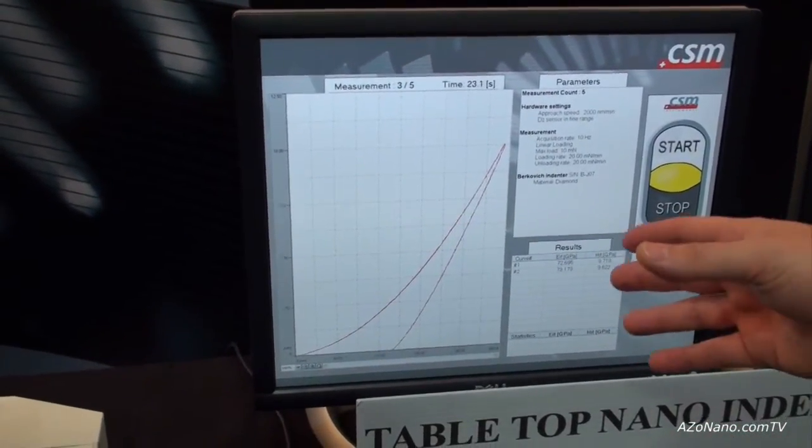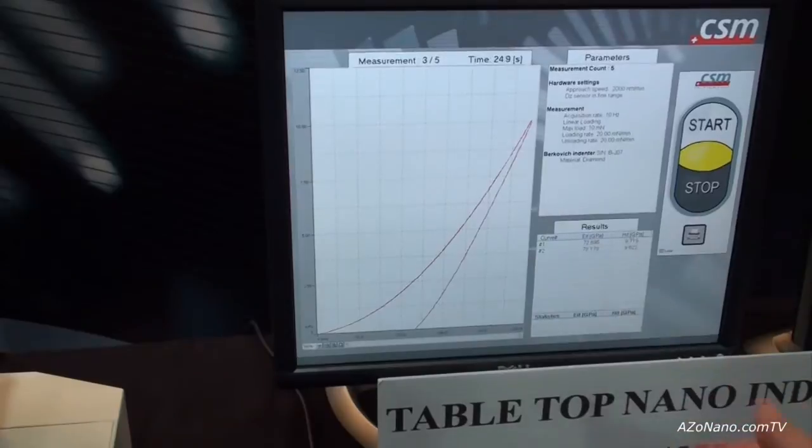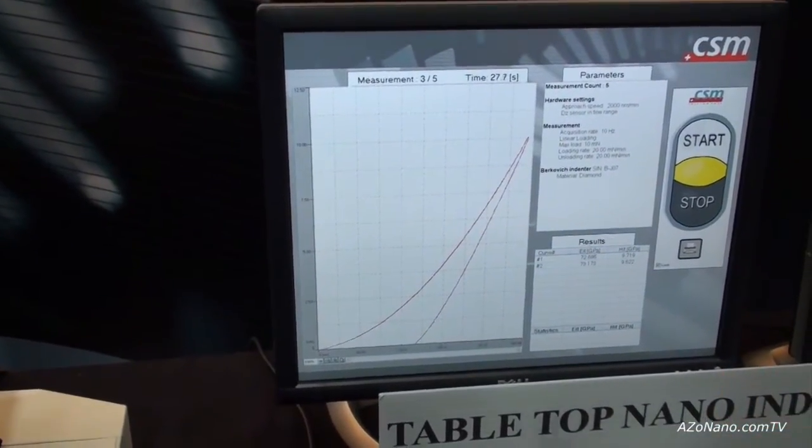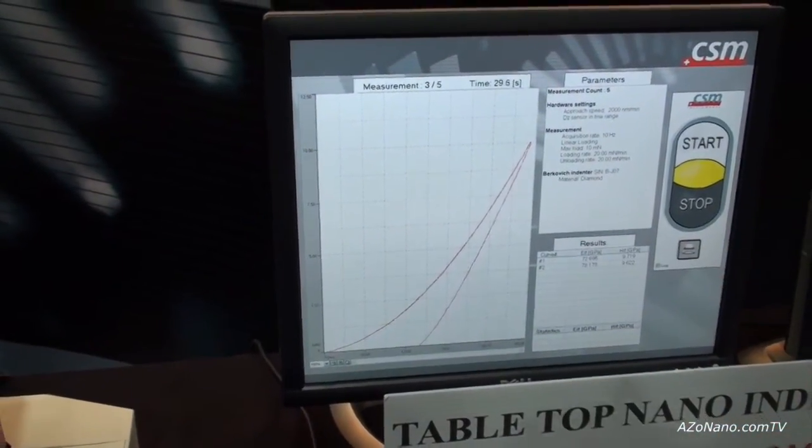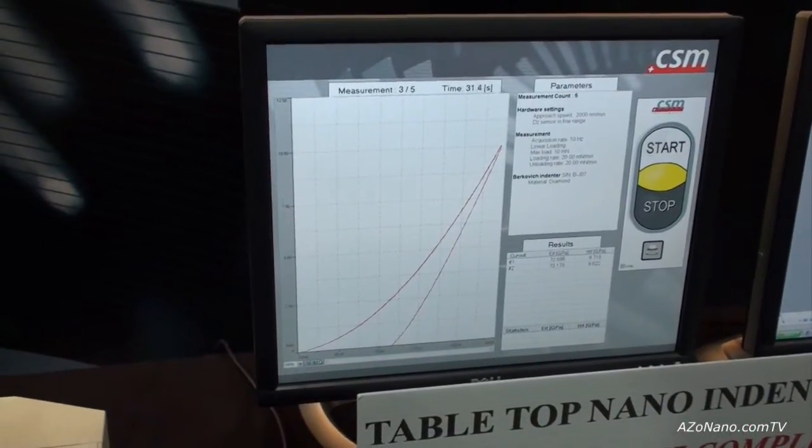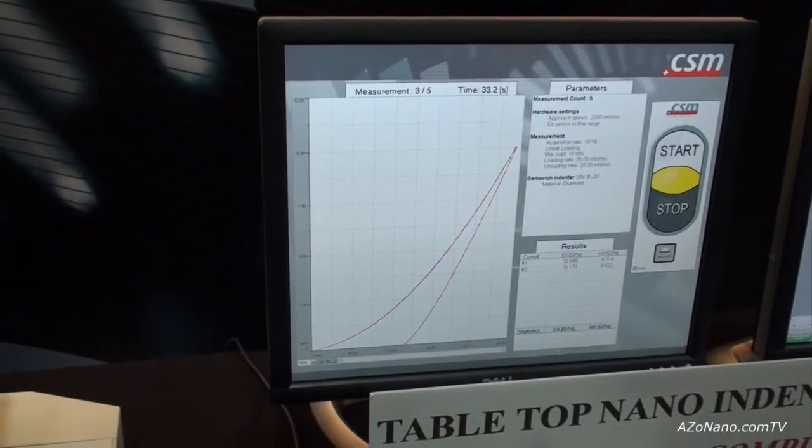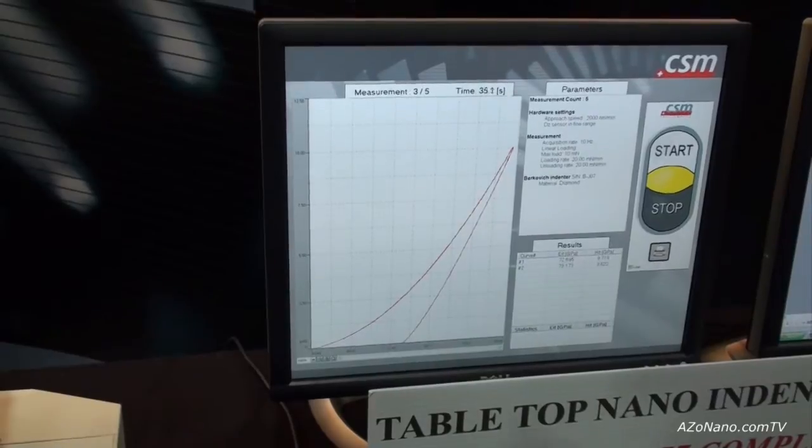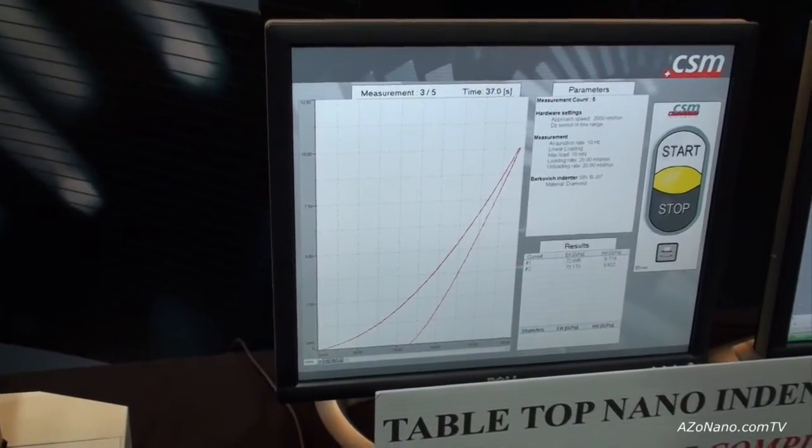What we can see here on the screen is a typical load depth curve. This machine can be upgraded with optical components such as a microscope. It can also be kept in its most standard form which is very cheap and it just makes a single or a line of indentations. So, it's a quality control tool.